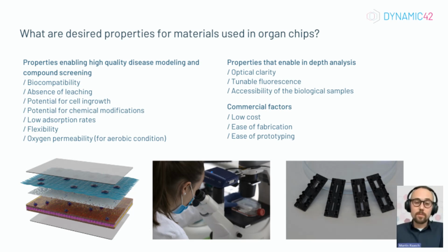It's often also a big issue for academic labs who have to look for funding. How easy is it to fabricate this for your employees? And how easy is the prototyping, so changing geometries, trying different things out. There are some materials that are more suitable for this than others.